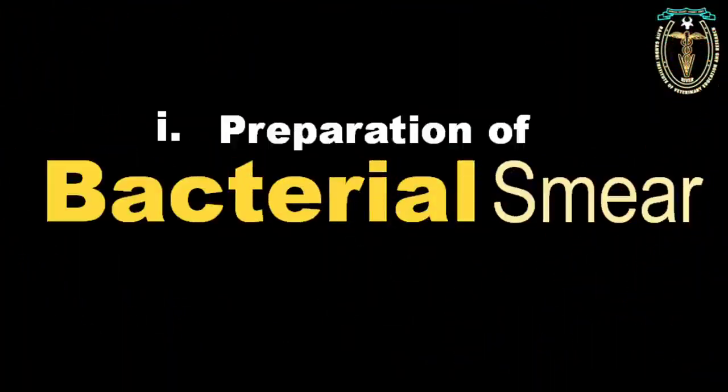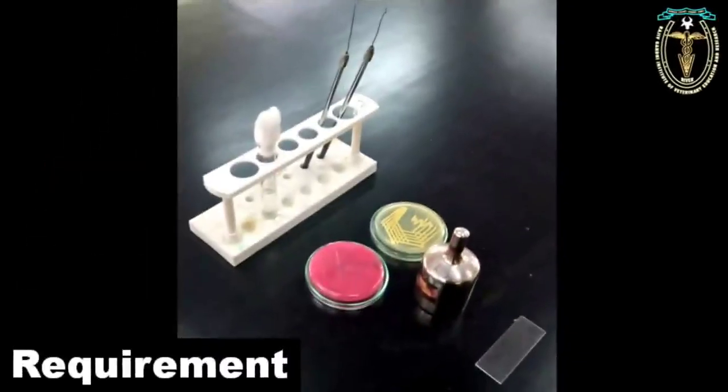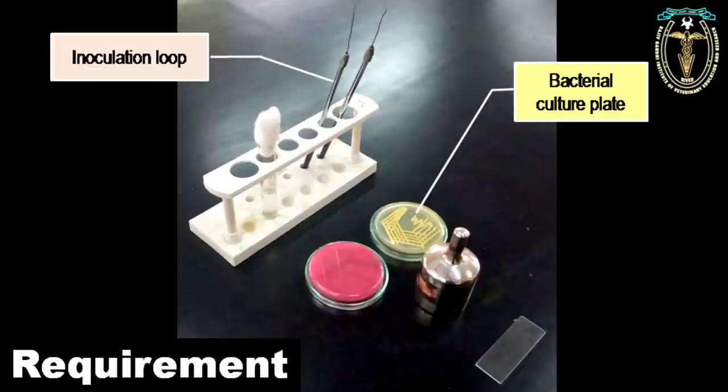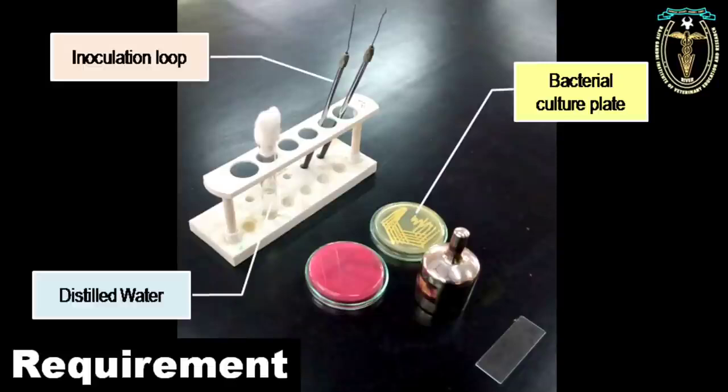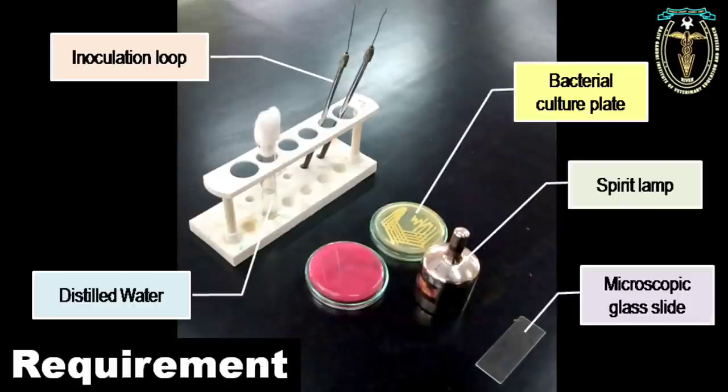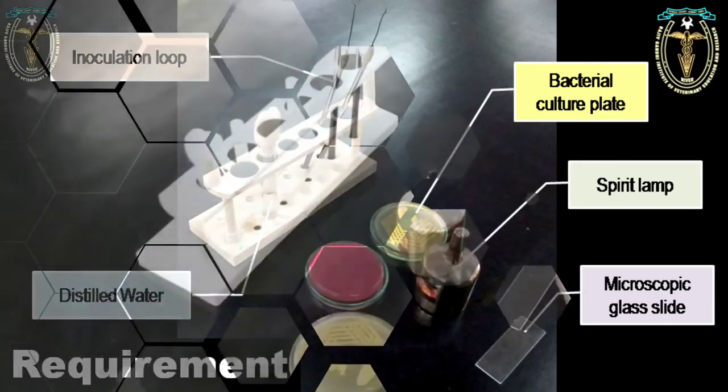The video demonstration. First, we will see about the preparation of the bacterial smear. The materials required are the bacterial culture plate, the inoculation loop, the distilled water, the spirit lamp, and the microscopic glass slide. These are the requirements for preparing the bacterial smear.